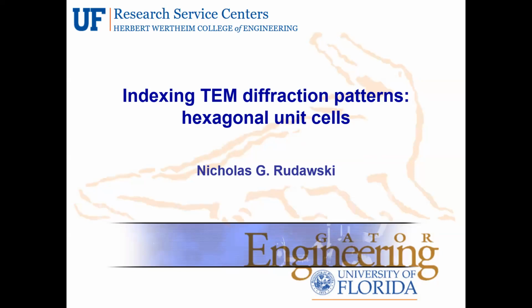I've had a lot of requests for doing a follow-up video because the indexing diffraction patterns for the cubic lattices and the cubic crystals was so popular. I've had a lot of questions or inquiries about doing one for hexagonal unit cells. So that's what we're going to do. This is going to be pretty ambitious here, but hopefully I'm going to throw enough information at you that there'll be some good stuff for you here. So we'll have a bit of an adventure today.